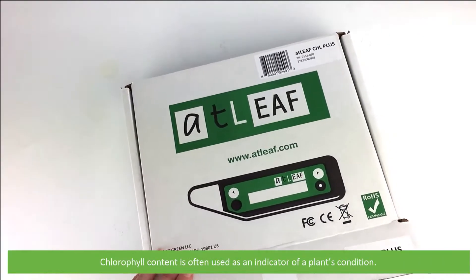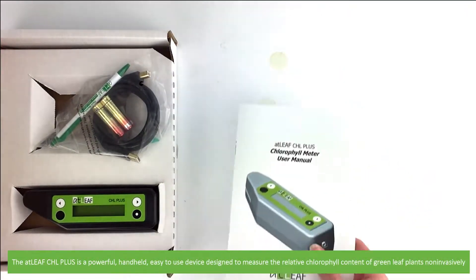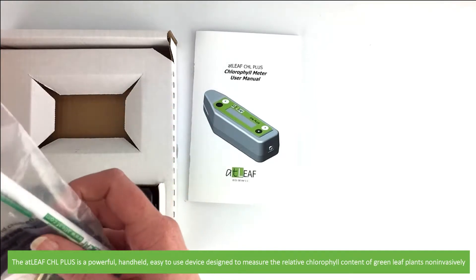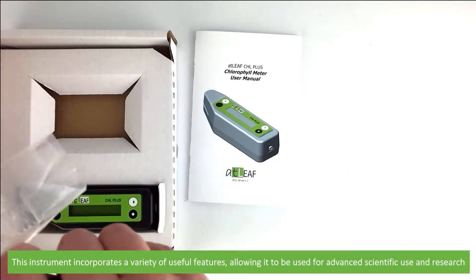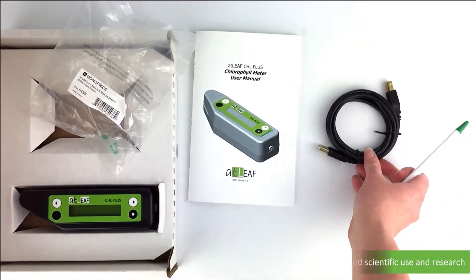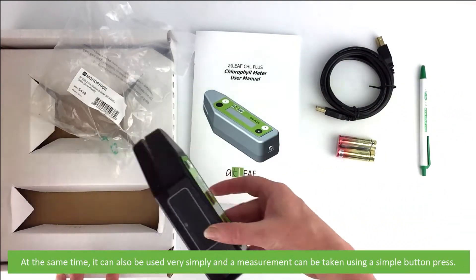Chlorophyll content is often used as an indicator of a plant's condition. The ATLEAF CHL Plus is a powerful handheld, easy-to-use device designed to measure the relative chlorophyll content of green leaf plants non-invasively. This instrument incorporates a variety of useful features allowing it to be used for advanced scientific use and research, and at the same time it can also be used very simply with a measurement taken using a single button press.